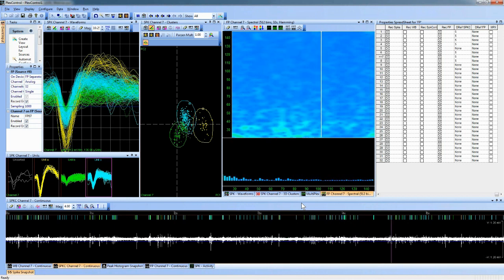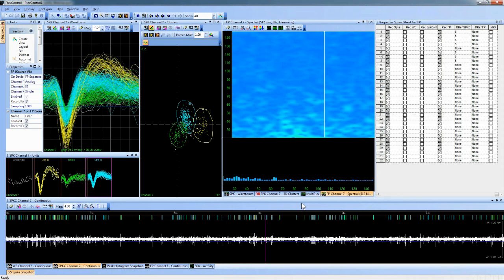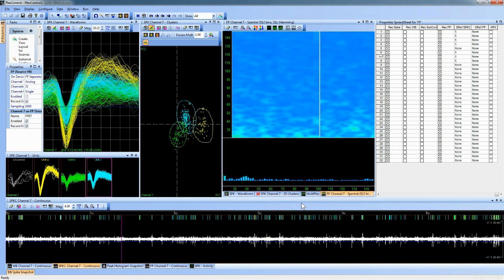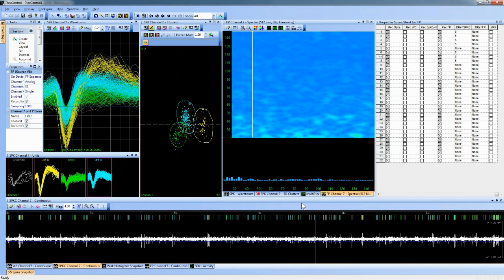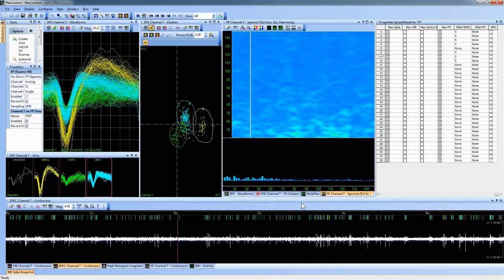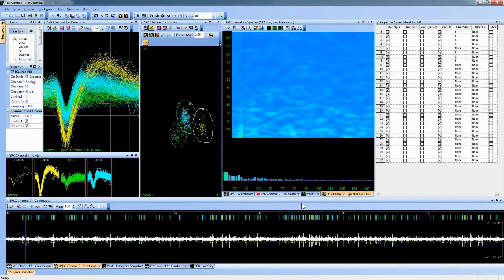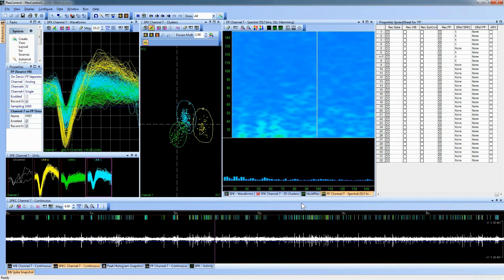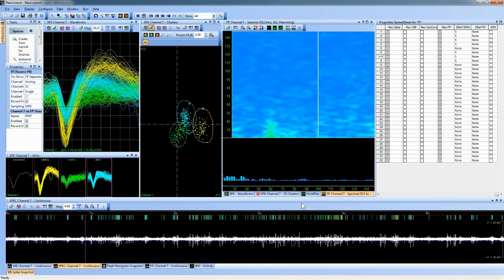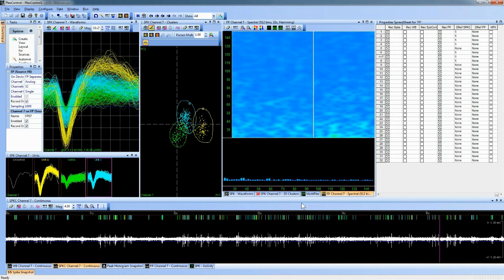Yes, you can. That's potentially a dangerous thing to do. If you were saving your spike continuous data while you were recording to file, you could change your referencing. It's probably not a great idea to do, because then you'd have some part of the file that didn't have certain channels referenced in a way and another part of the file that had channels referenced in a different way. One way around that would be to record 2 different files.